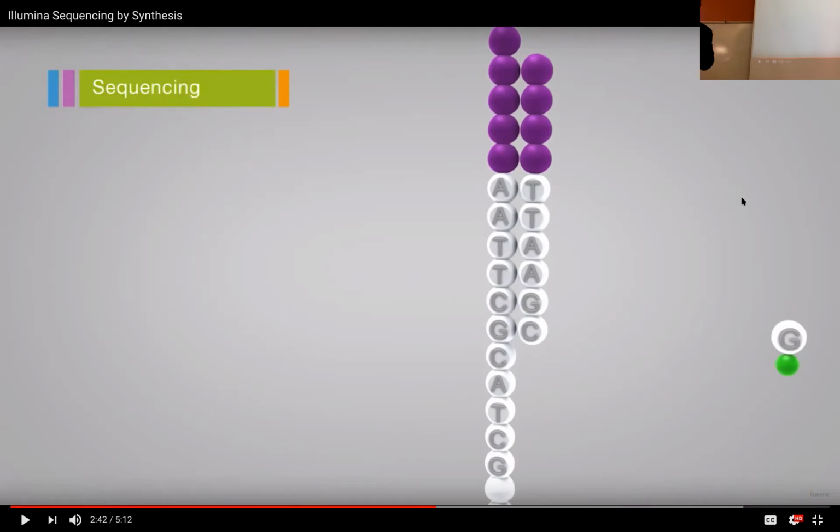The machine tries to map the whole lawn to say, that's a cluster, that's a cluster, and it will physically tag that location as a cluster. It will give it an ID so that your reads come with a unique ID for that specific cluster. So you do the clustering at the initial stage.